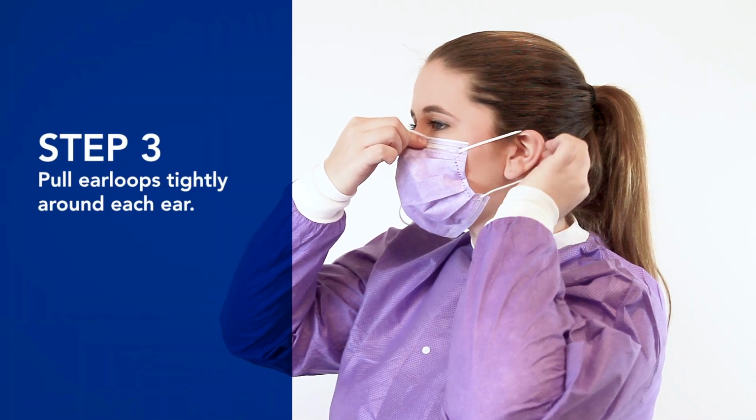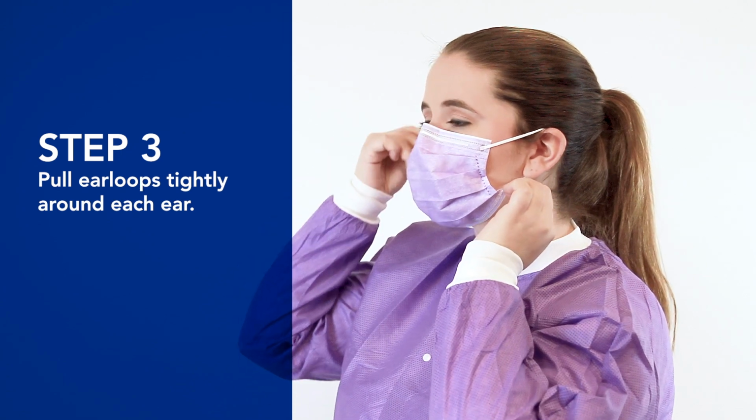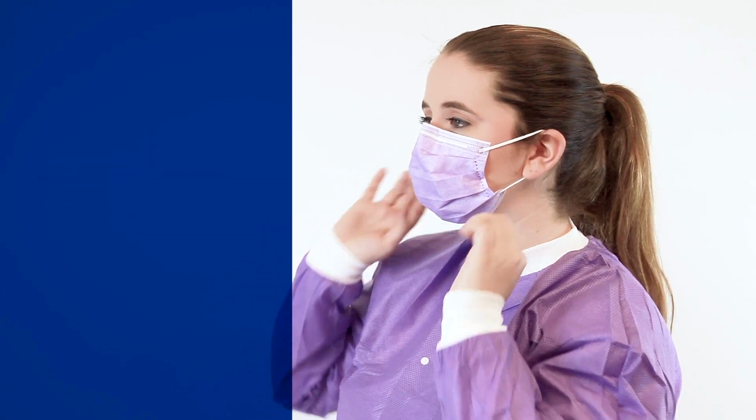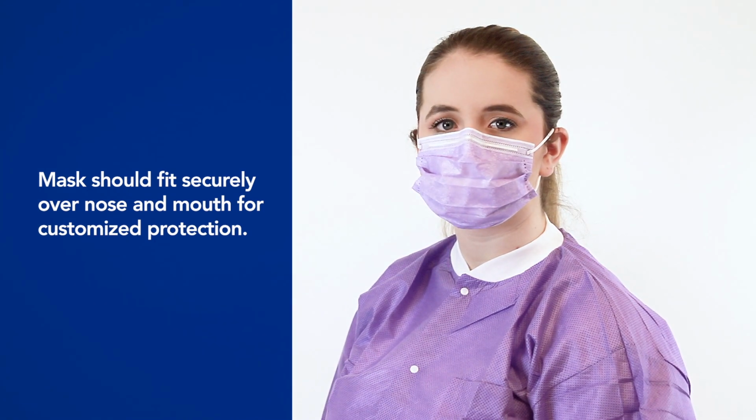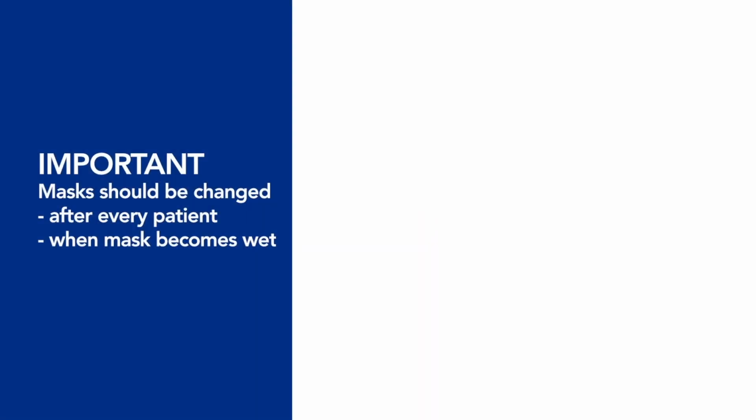Step 3. Pull the ear loops tightly around each ear. If you followed these instructions, the mask should fit securely over the nose and mouth for customized protection. It's important to note that your mask should be changed after every patient and whenever it gets wet.